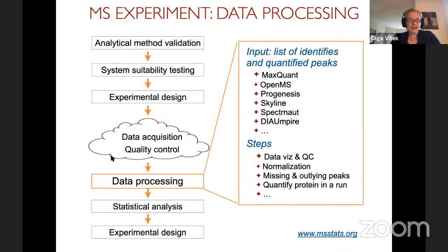Okay, so after the data are collected, as I mentioned, the very important first step is data processing, which in our case happens through converters in part, such as removing decoys. If your identifications of spectra in DDA have some cutoffs, like a Q value cutoff and so on, there can be filtering based on that. And removing, for example, redundant peptides. Sometimes in the same run, the same peptide ion has multiple peaks. So cleaning that up and so on. But then the second part of data processing, which is just as important, and this is what happens already in MSstats, is data visualization, QC, and normalization.